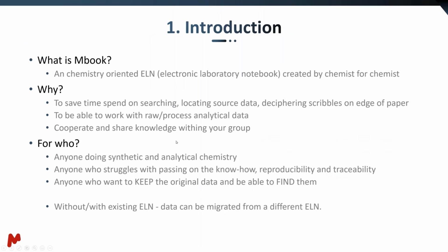Now, what is Mbook? For those who are joining for the first time, it's an electronic laboratory notebook which is chemistry oriented, and it's created by chemists for chemists. Why? Mainly to save the time you spend on searching and locating the source data, or reading paper notes somewhere, or another paper down in the drawer.